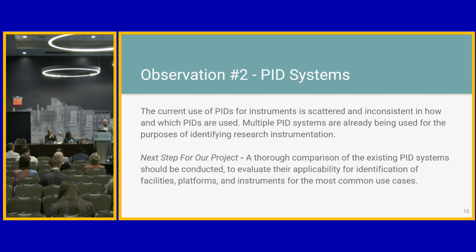Sometimes multiple PID systems are used to document facilities or instruments, but the idea at this point isn't to pick one, but to make people aware of all the ones we're finding as we go through. We're actually working on a PID graph as a project team now during our calls, and we hope that it will basically look like a pretty Excel spreadsheet with different systems, what they are supposed to do, links to them, and things like that.